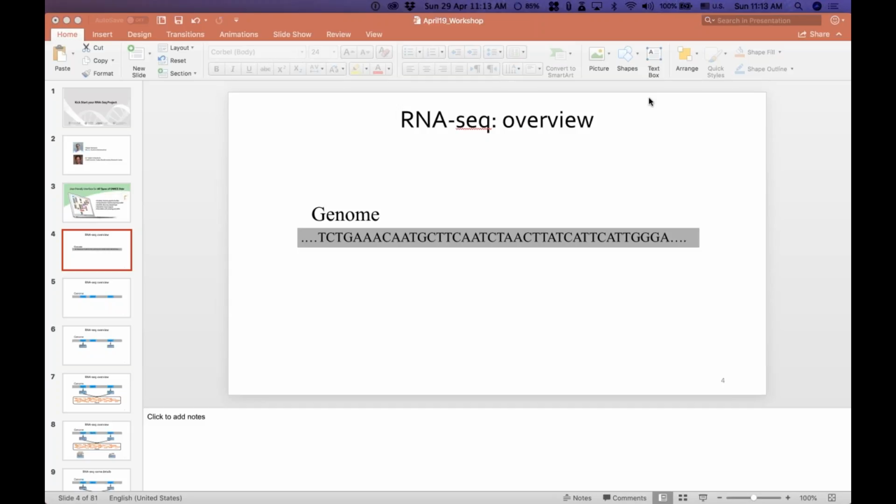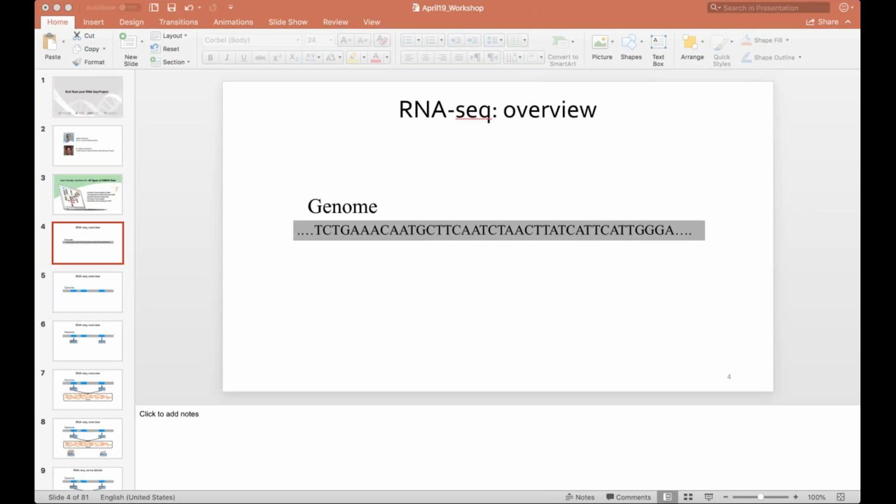So before we start, I'm just going to give you an overview of a few things that we have been working on to make this platform more useful. So the first thing that we have is, in parallel to the platform itself, we produced a number of courses on transcriptomics, and a lot of the things that we'll be covering today are going to be available online for free for all the users. And you can see under courses a number of courses related to transcriptomics.